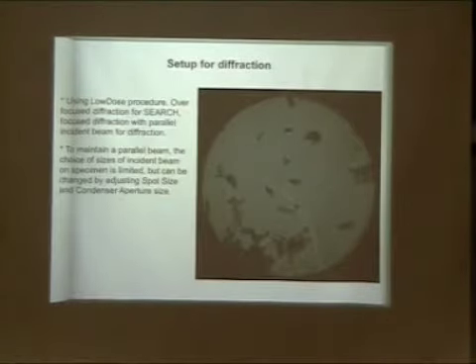However, this choice is very small. You can change your beam size very small and big, any size you want. It's easy to do that, but not all beam sizes are a parallel beam. So if you want a parallel beam, your choice is quite limited. Basically, you can do that by changing the condenser aperture, changing the spot size, and then getting the proper size of the beam, but in a roughly quite parallel condition. So this is how you set up your search, your exposure mode.